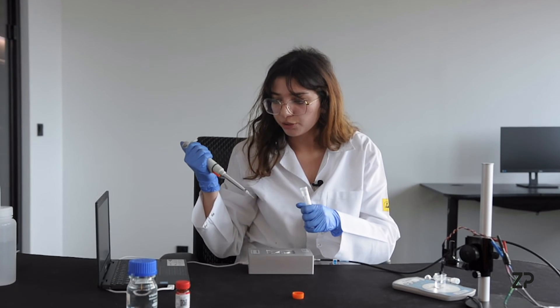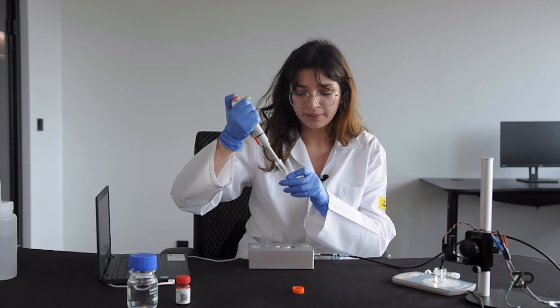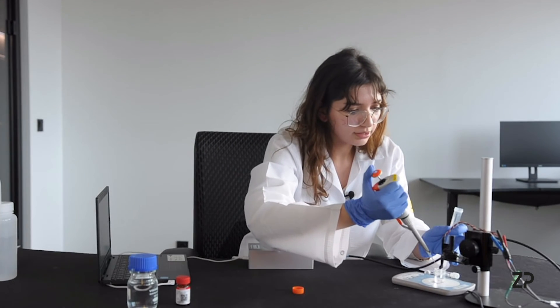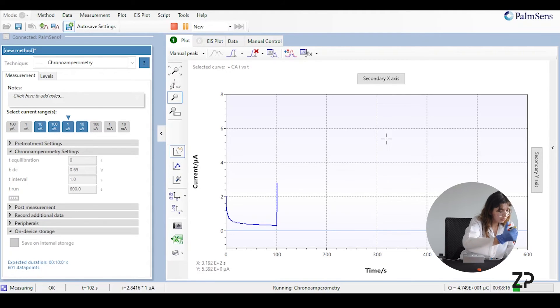We're approaching 100 seconds, so we add 10 microlitres of our lactic acid to the beaker. As you can see from the curve, there is a spike straight away at 100 seconds, showing that our lactic sensor is detecting lactate.